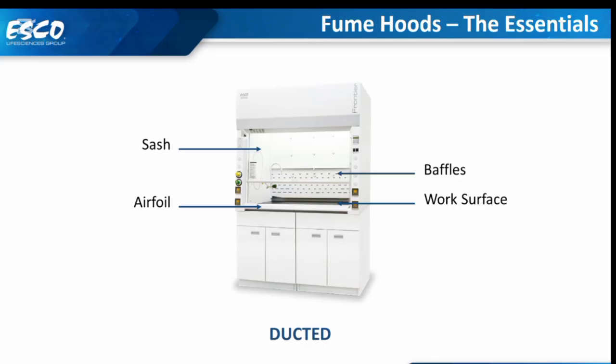So here we can see a basic design of a ducted fume hood. We have the sash, airfoil, baffles at the back, and the work surface. Not mentioning the plugs and the water and gas connection.